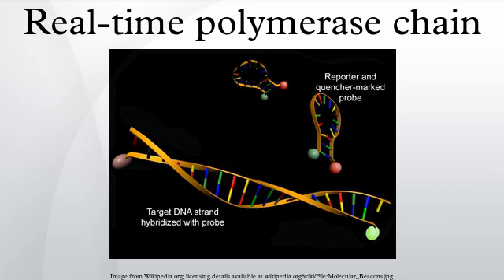Background. Cells in all organisms regulate gene expression by turnover of gene transcripts. The amount of an expressed gene in a cell can be measured by the number of copies of an mRNA transcript of that gene present in a sample. In order to robustly detect and quantify gene expression from small amounts of RNA, amplification of the gene transcript is necessary. The polymerase chain reaction is a common method for amplifying DNA.